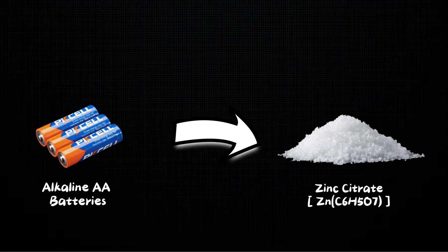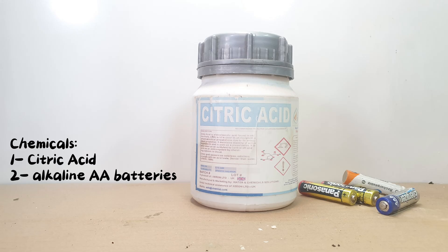In today's video, I will be synthesizing zinc citrate from alkaline batteries. So let's start the video. The chemicals you need for the synthesis are citric acid and alkaline AA batteries.